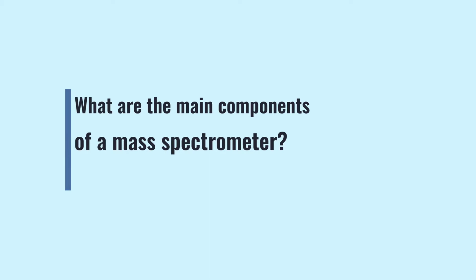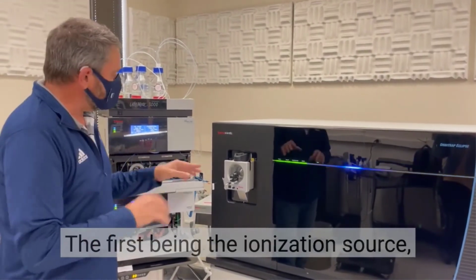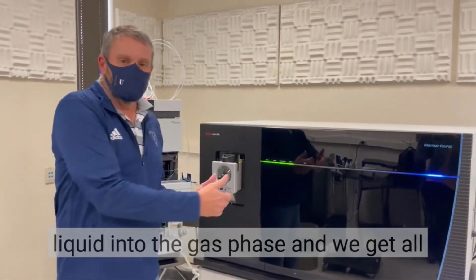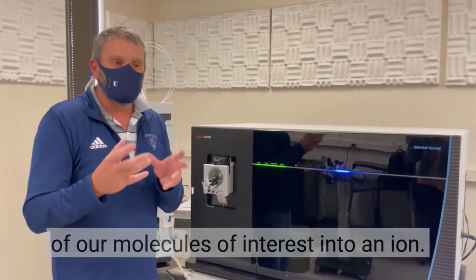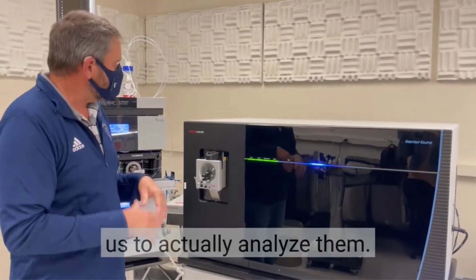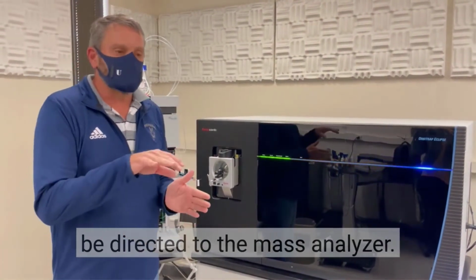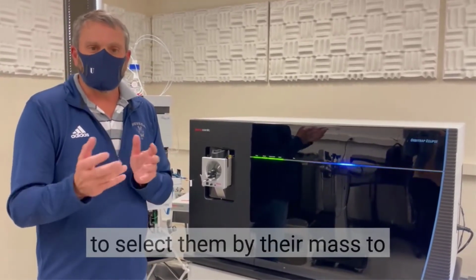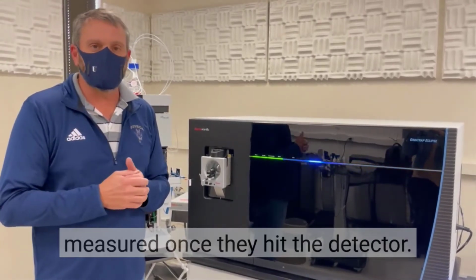What are the main components of a mass spectrometer? There are three main parts. The first is the ionization source, where we transfer all of our liquid into the gas phase and get all of our molecules of interest into an ion. They have to be charged for us to analyze them. Once we form those ions in the ionization source, they are directed to the mass analyzer. The mass analyzer selects them by their mass to charge, and they are then measured once they hit the detector.